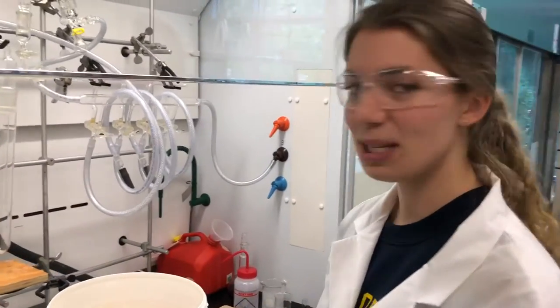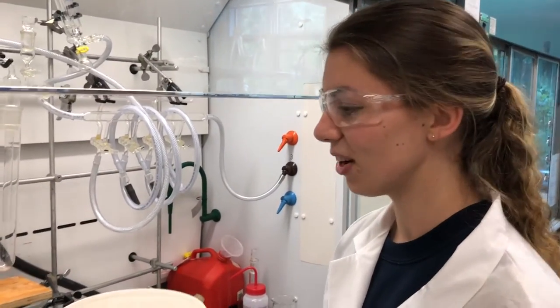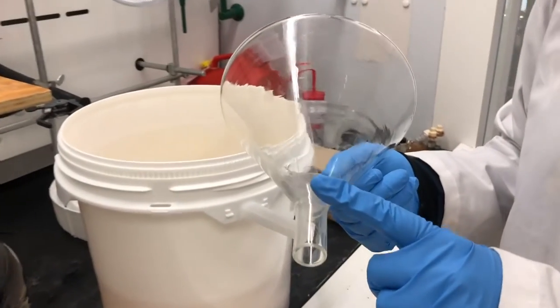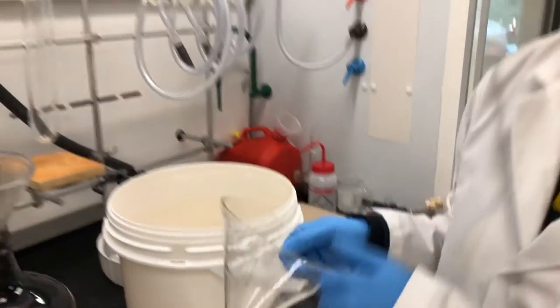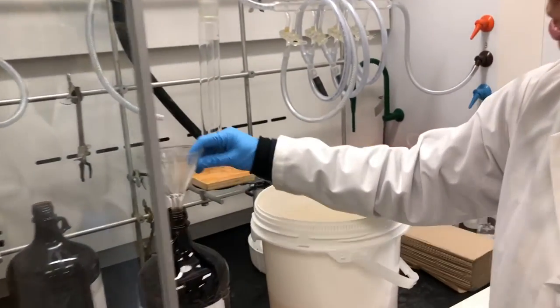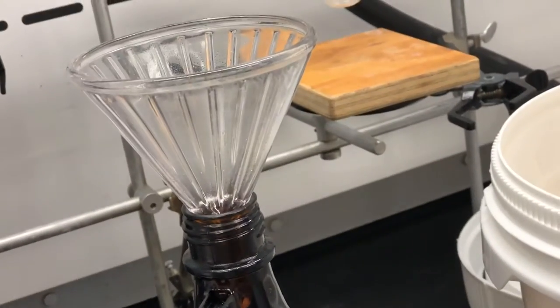When you pour the base bath into the waste container, you have to be careful about what kind of funnel you choose. If you choose a smooth funnel like this, it will get air locked and you will get backlash with the base bath. So if you choose a ridged funnel like this, the air can travel out and you will get a much smoother pour.